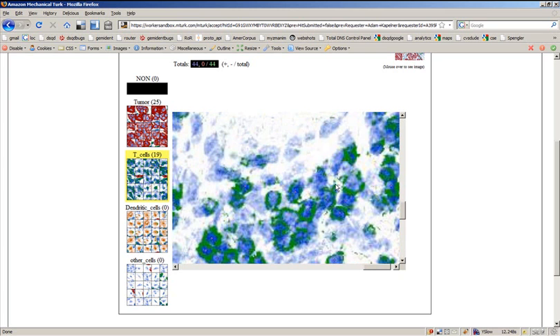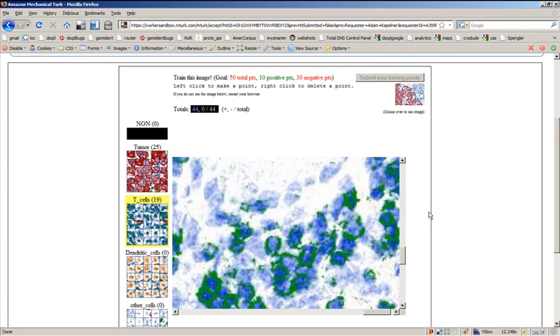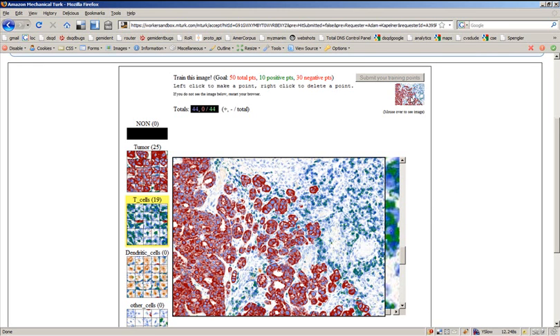Okay. Let's look for some dendritic cells. I think the thumbnail view would be helpful. I could see there's a little bit of yellow in the center towards the bottom left. Center bottom left.